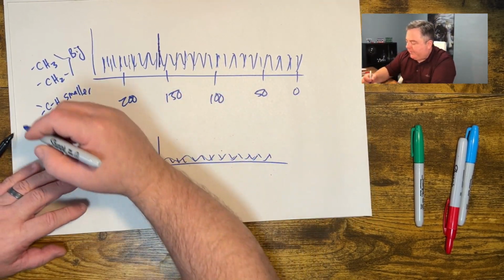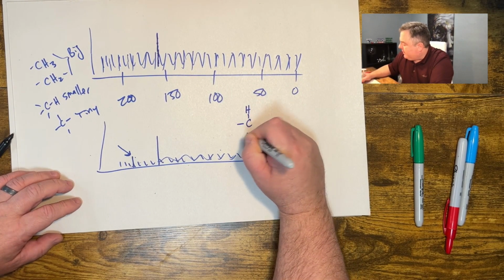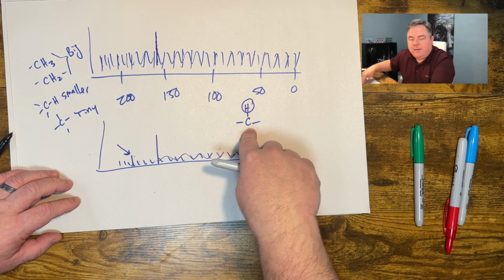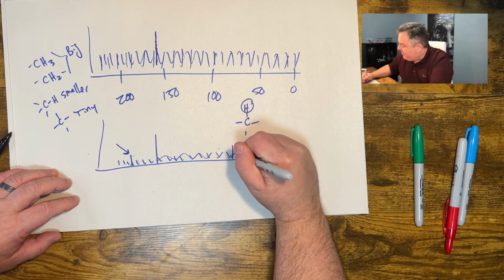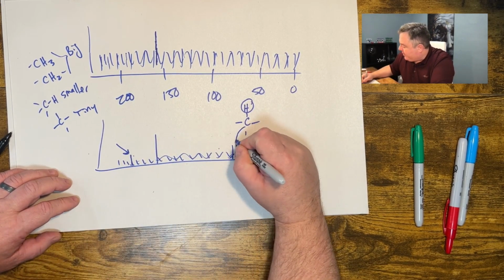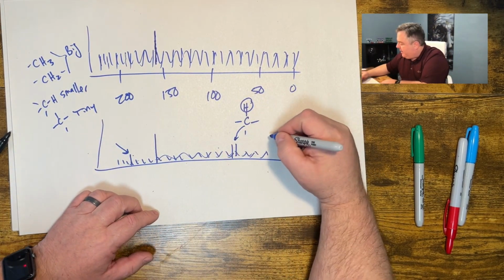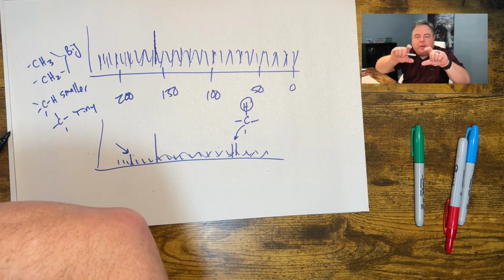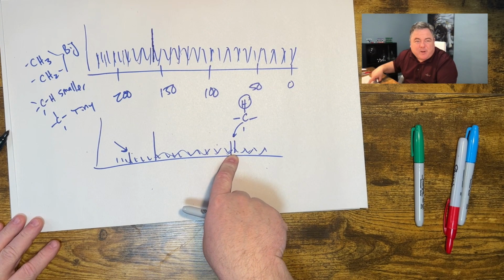The other thing about that is if I'm looking at a carbon atom with a hydrogen on it, this is a little tiny magnet on top of this magnet. So this carbon, if it has one hydrogen, if I don't do anything about it, it'll split into a doublet. And you'll get two peaks for that carbon atom. The problem is if you have one big peak, it's this big, but you split it into a doublet, you get two half-size peaks. And pretty soon it gets into the noise, and that's a problem for me.